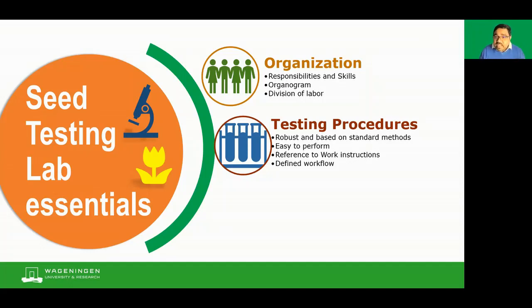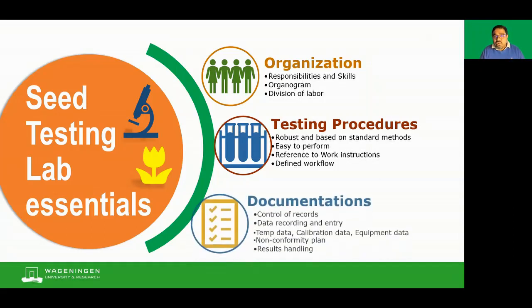And the test has to be easy to perform, and there should be reference work instructions. There should be work instructions written somewhere that I can refer to: what temperature it should be, at what time I should be taking the seeds out, which species I should put at what temperature, and for how long. All these things, and there should be a defined workflow, what is done when and by whom, shown in a flow diagram.